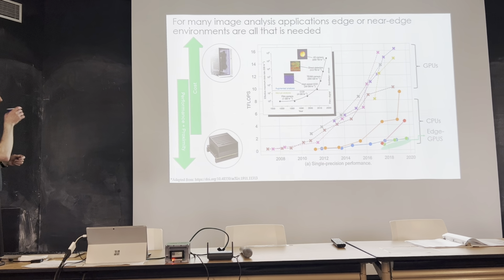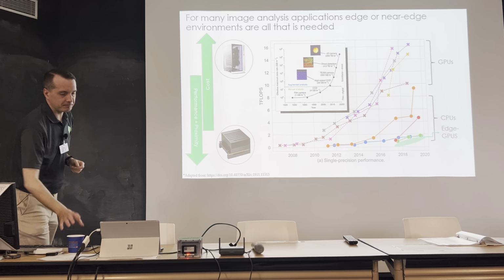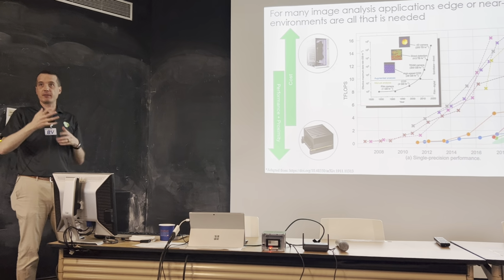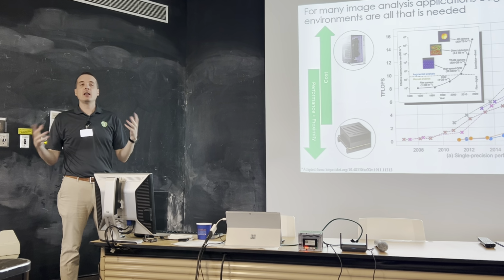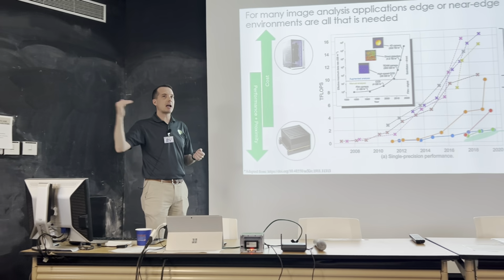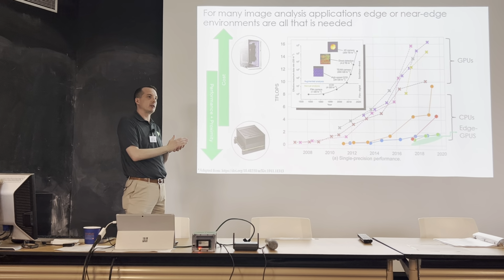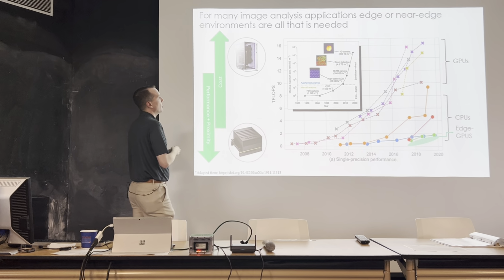So there's a lot of things that go into this when it comes to edge computing and why do we use edge computing and everything else. Because one of the things is that a lot of institutions possibly have their own cluster, their own GPU, their HPC, and so on and so forth. But there again, you're getting into that situation of, well, how do I get that resource to the microscope? Right? Even if it was on campus and on site, you're still going to run into bandwidth issues, throughput problems, and IT restrictions.